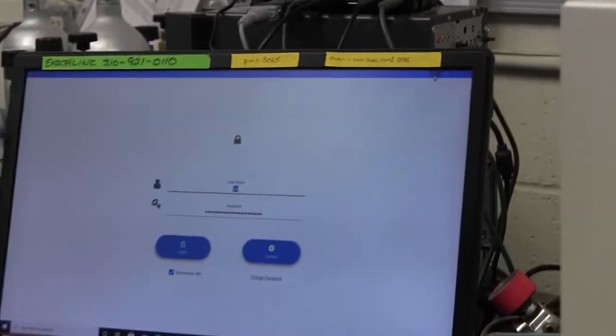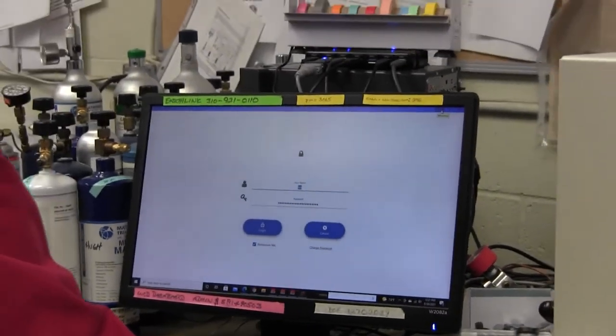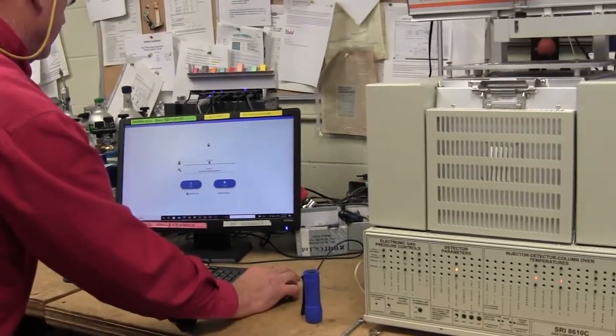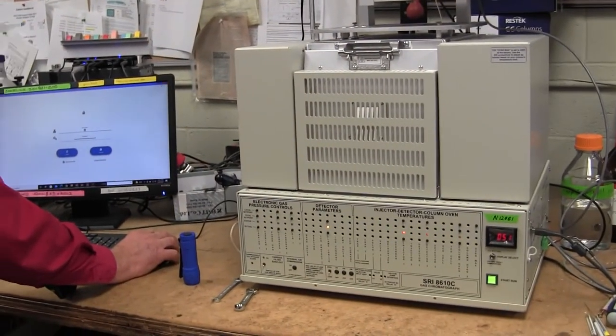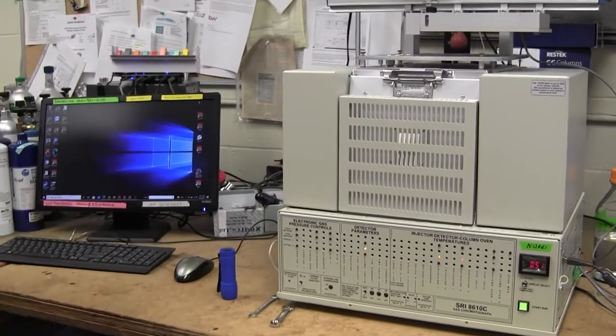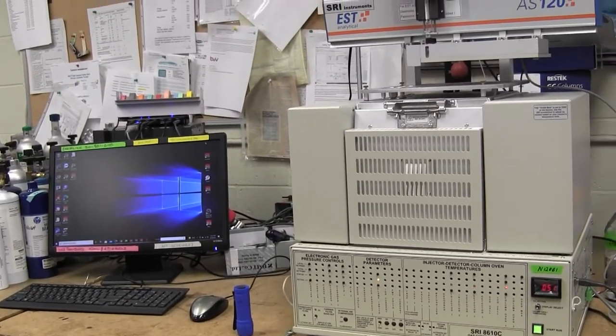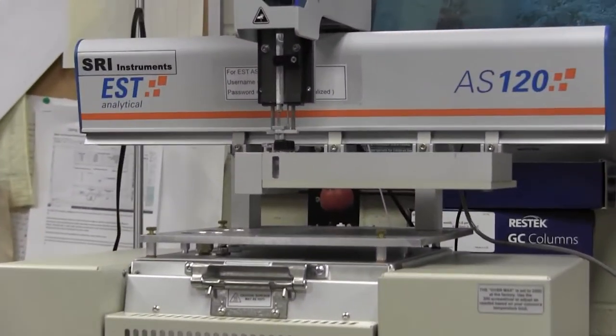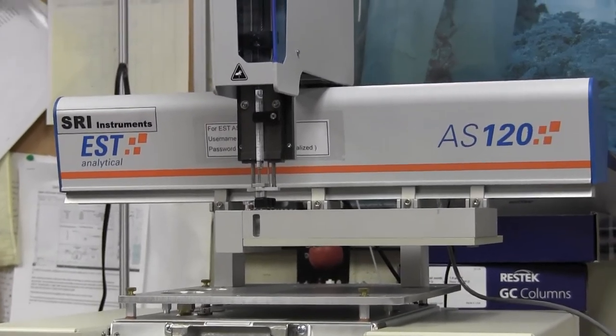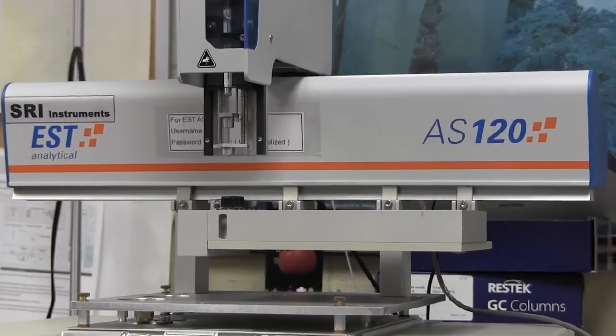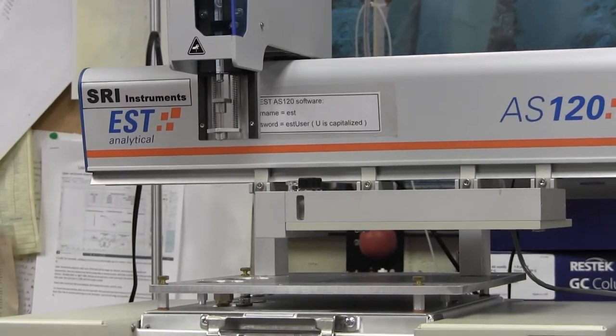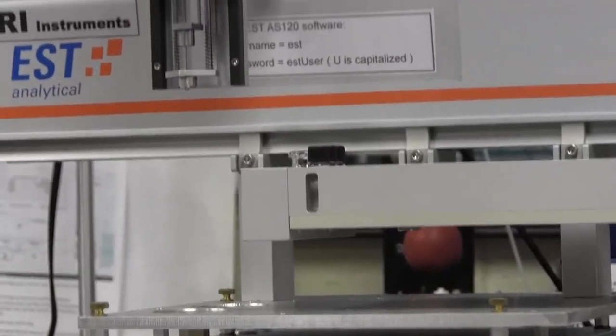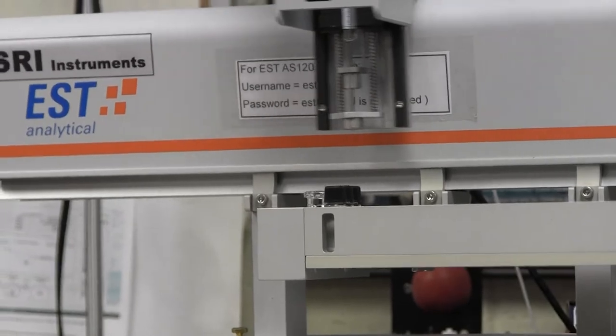Okay well look, while I was talking, the auto sampler went and did its thing again, which is great. Let's watch it inject one more time and then unless you can think of anything that we haven't talked about, then that'll conclude the video. There it goes. Well, thank you very much. I appreciate your time.